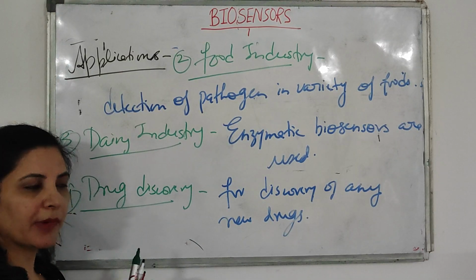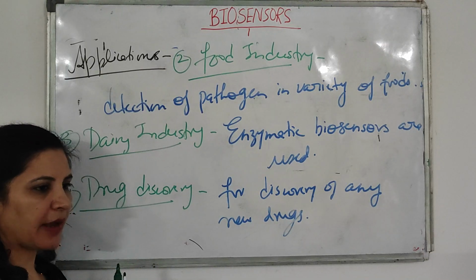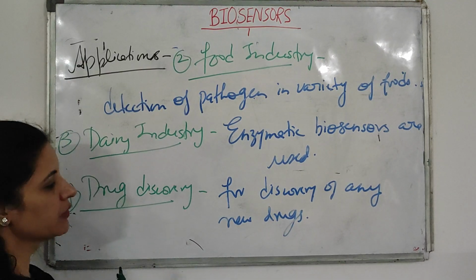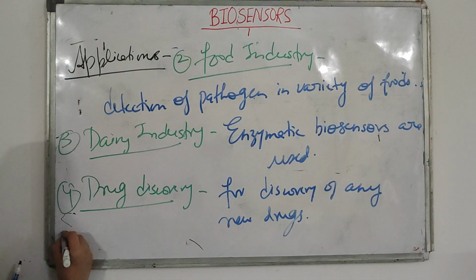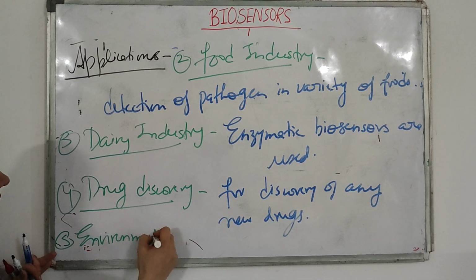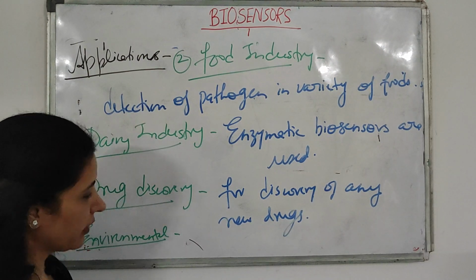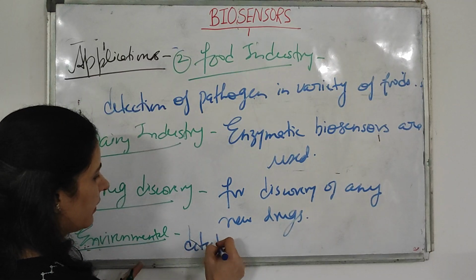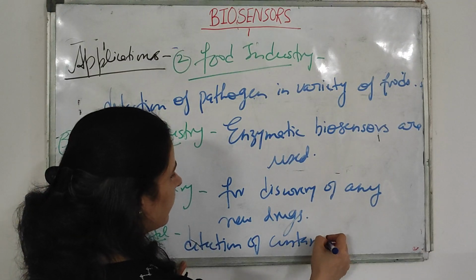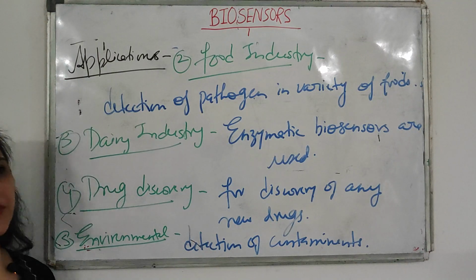Then the immobilized biological material will be your antibiotic or whatever drug you want to test, and by using the biosensor you will detect whether that drug is working or effective or not. Okay, so these are the uses. Next is use in environmental study. Like you use this biosensor for detection of any contaminants, whether they are there or not. Okay, so these are the applications of your biosensor.